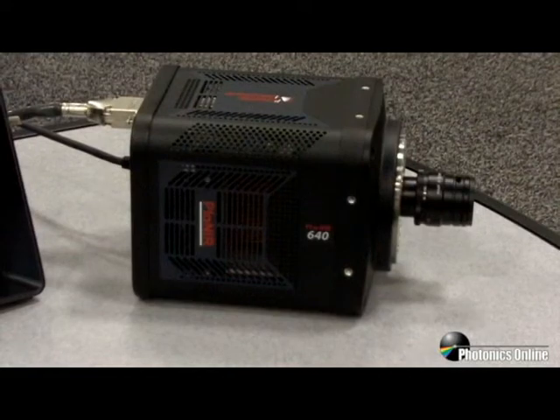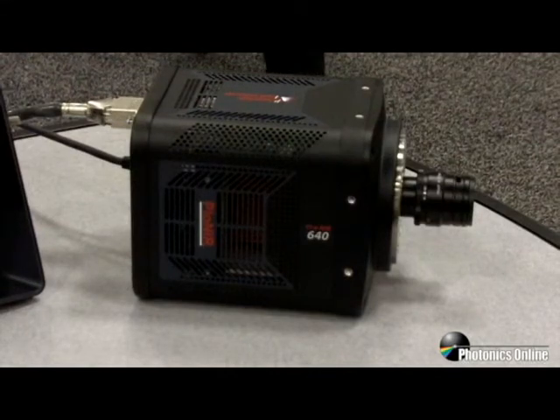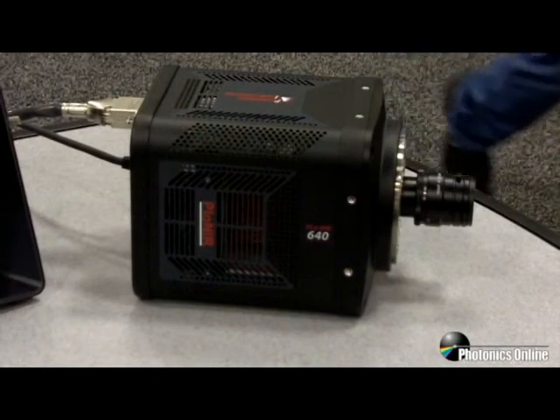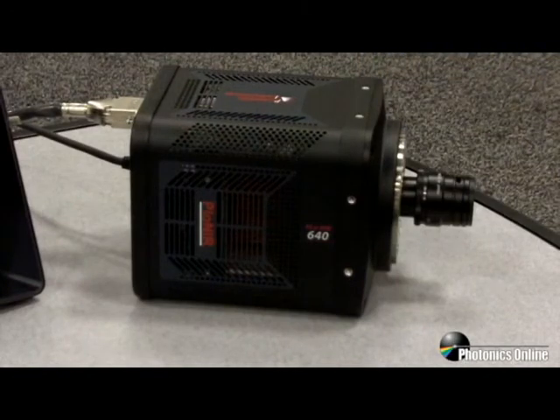You do not have to use liquid nitrogen to achieve low dark currents. The camera also has the flexibility to use external liquid circulation for vibration-sensitive environments. The sensor provides very good sensitivity, with greater than 80% quantum efficiency over most of the wavelength range of 0.9 micron to 1.7 micron.